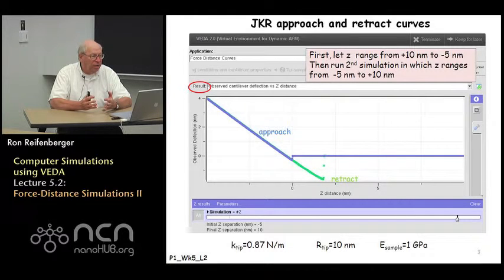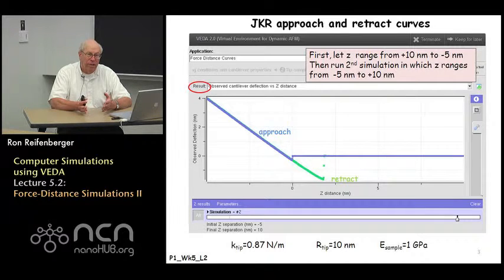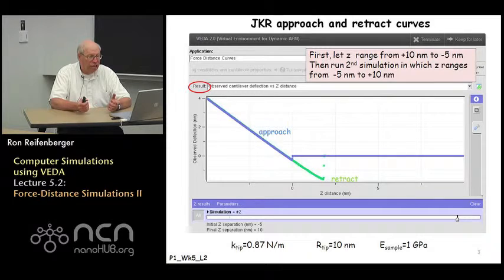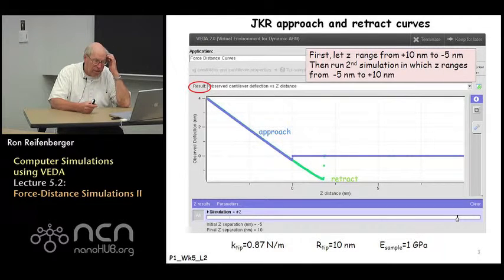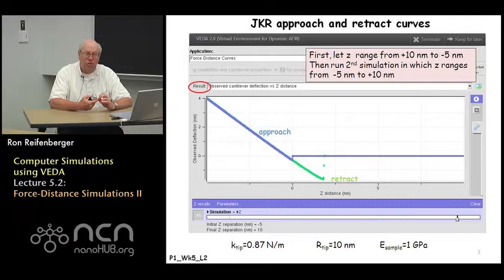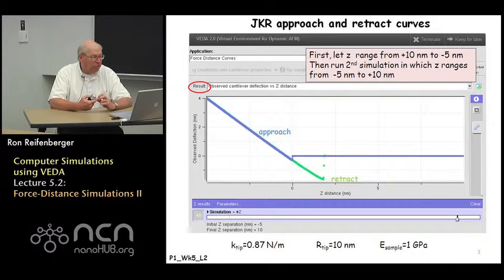When you do these approach and retract curves you'll have to do two separate simulations. The first simulation goes from plus 10 nanometers to minus 5 nanometers for Z — that gives you the approach. Then you run a second simulation in which Z ranges from minus 5 nanometers to plus 10 nanometers — that's the retract curve. You can display both simulations in the window by clicking the all button in the bottom left of the VEDA window.